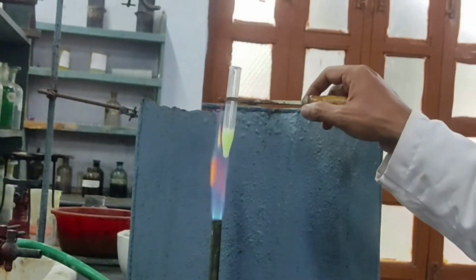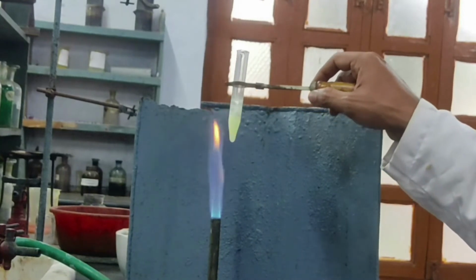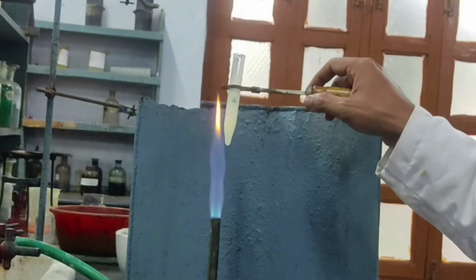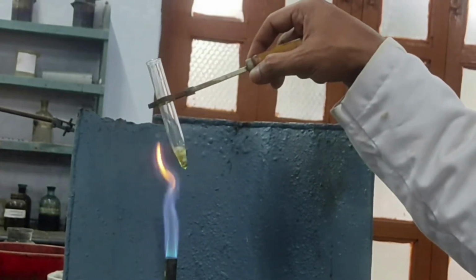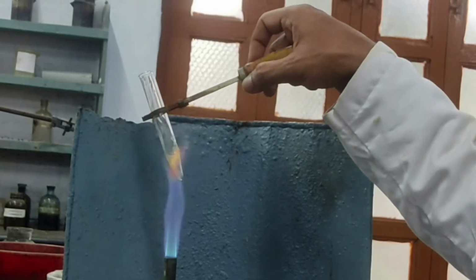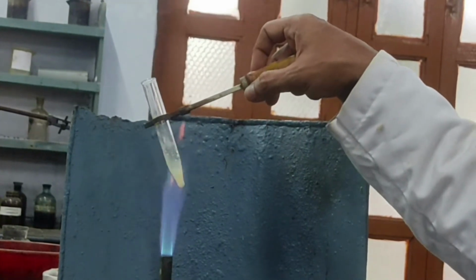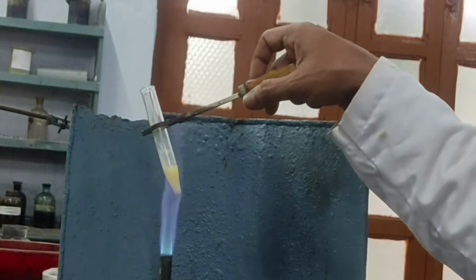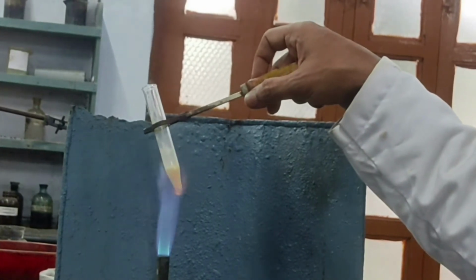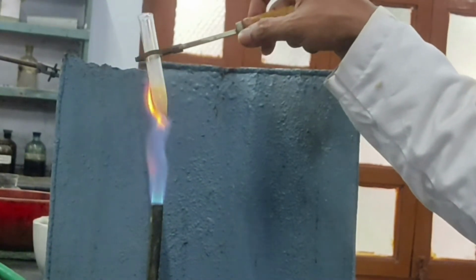You heat such that the total solution is evaporated. That is also called evaporated to dryness. You have to heat it till the total precipitate is dissolved.